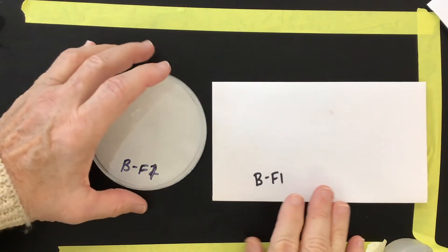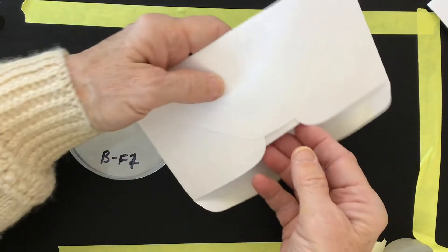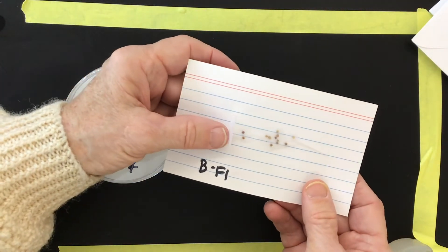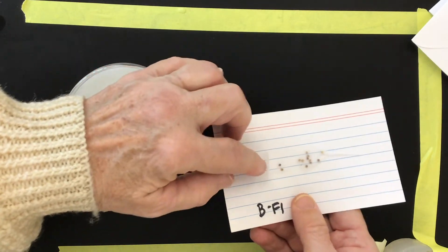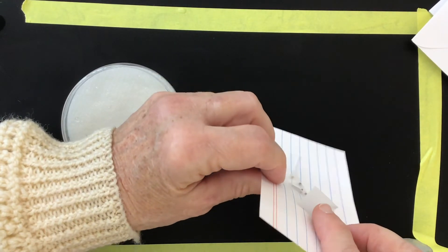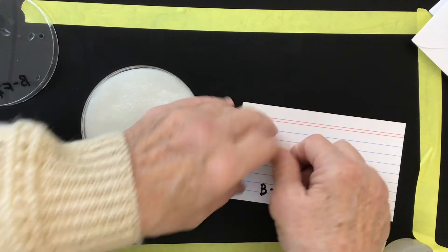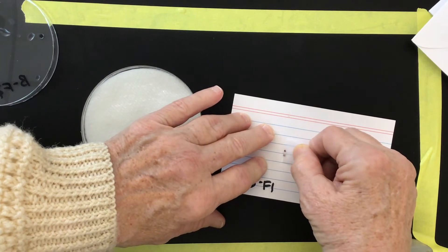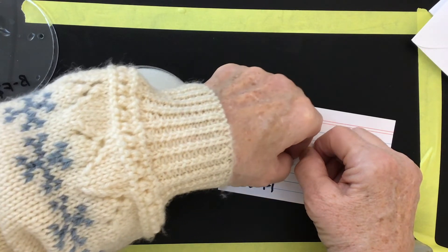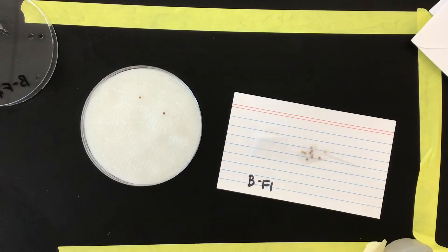Now I'm ready to do the second one. You can double check that I've got BF1 on my dish and BF1 on my envelope and hopefully BF1 on my seeds. So all the rest of them, once we're past the A's, have a little handle. I made a little handle so it's easier to get the tape off on these later batches. So I'll take off the lid here slowly because they're going to jump if that static electricity gets them.